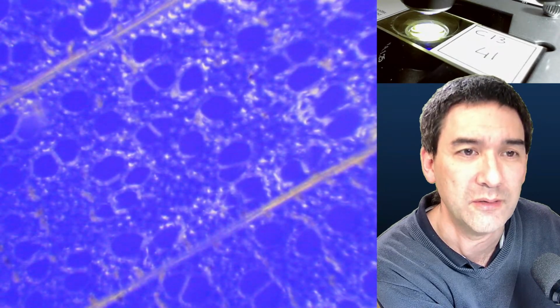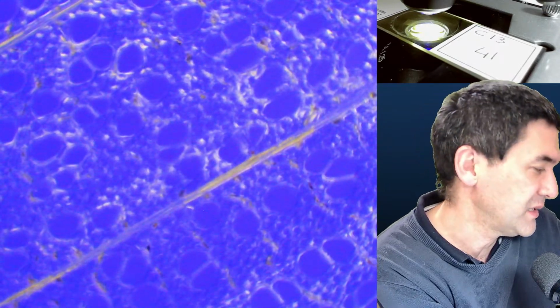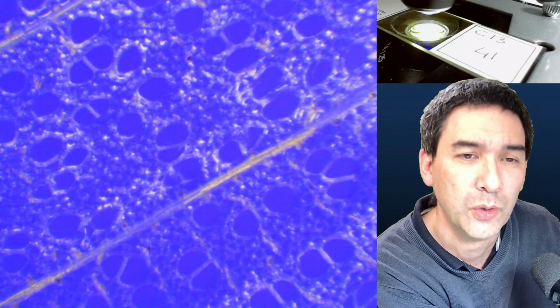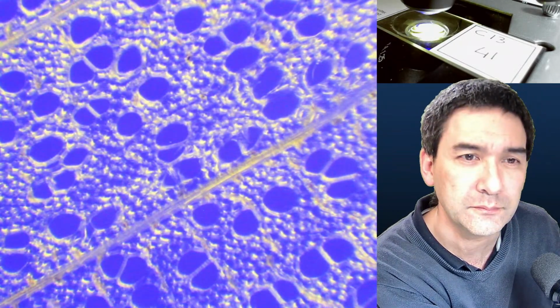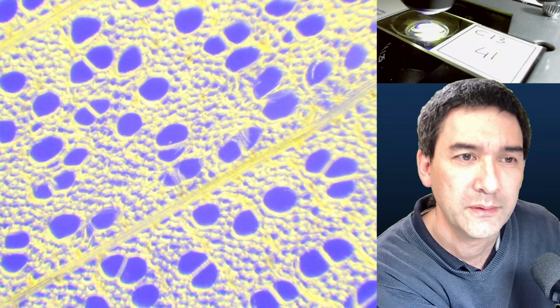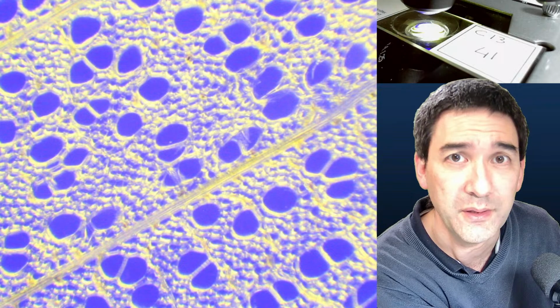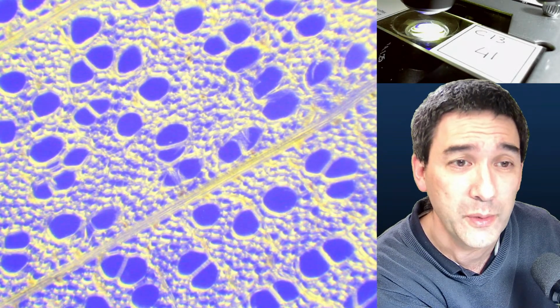So what I just want to say is this is just one aspect of a whole repertoire of different techniques, which you simply have to choose depending on the specimen that you want to look at, right? So this here, for example, that's wood. It's opened up, and we're able to see the wood has very thick cell walls, and therefore we're able to see it quite well.